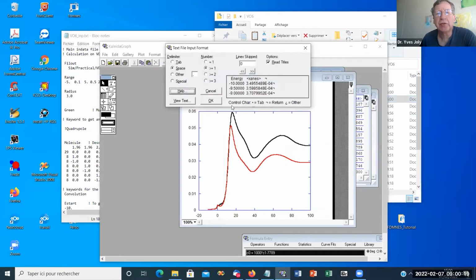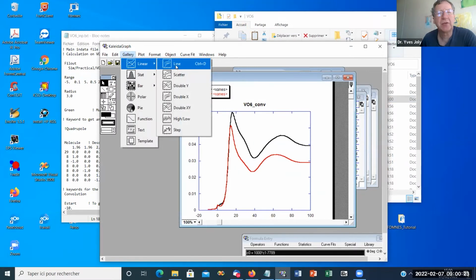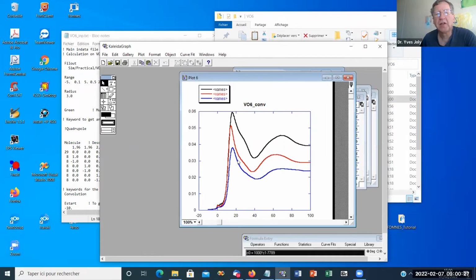I take the convoluted spectra like before. So we will have the series from vanadium to copper. You can see it's even lower than the previous one. It goes versus Z, we go down. But it's anyway roughly more or less the same kind of shape. But here it's broader than in iron. Because it's broader, we could check why it is broader.